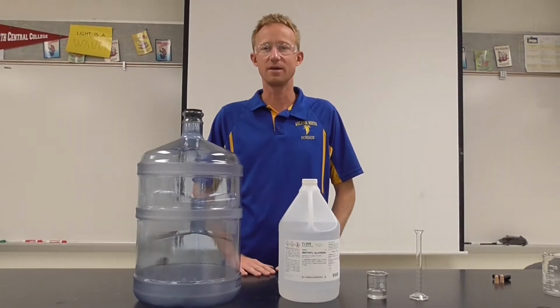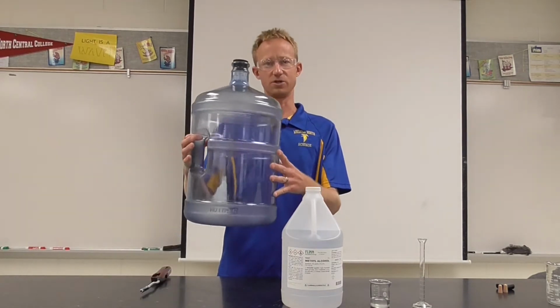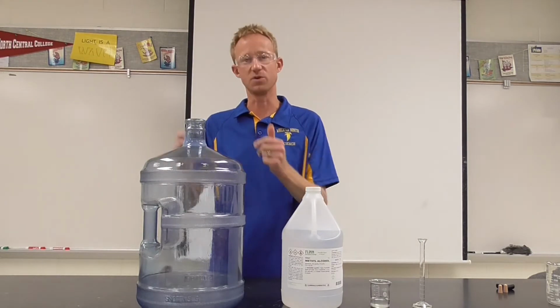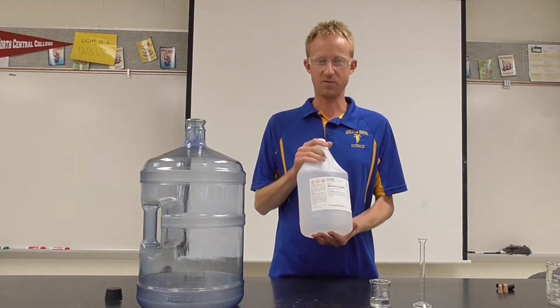What we're going to do today is called the methanol demonstration. So what we have is, these are water jugs. People used to have water delivered to their homes in these. It's empty. Well, it's filled with air right now. And we have methanol. Methanol is a type of alcohol.